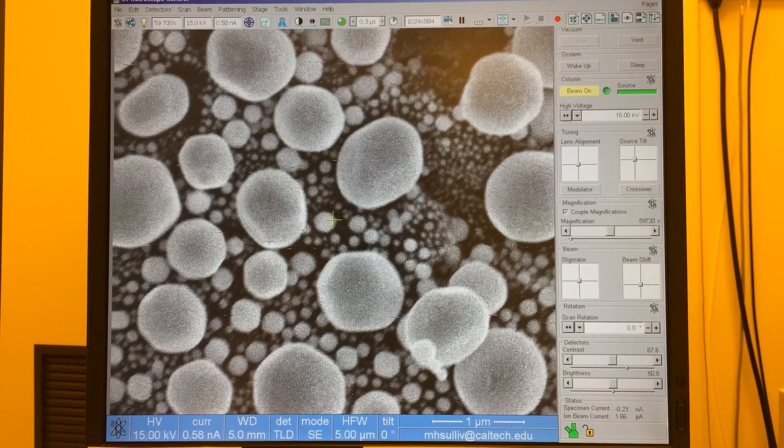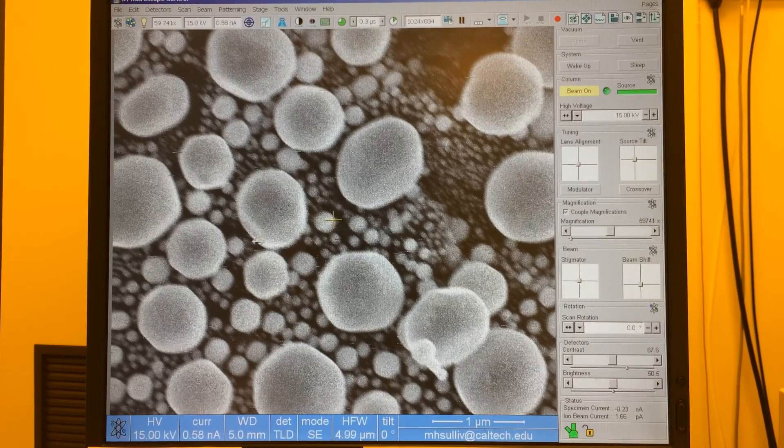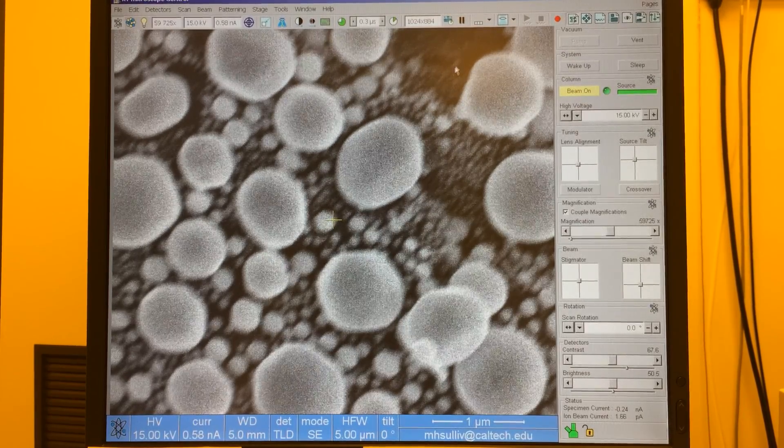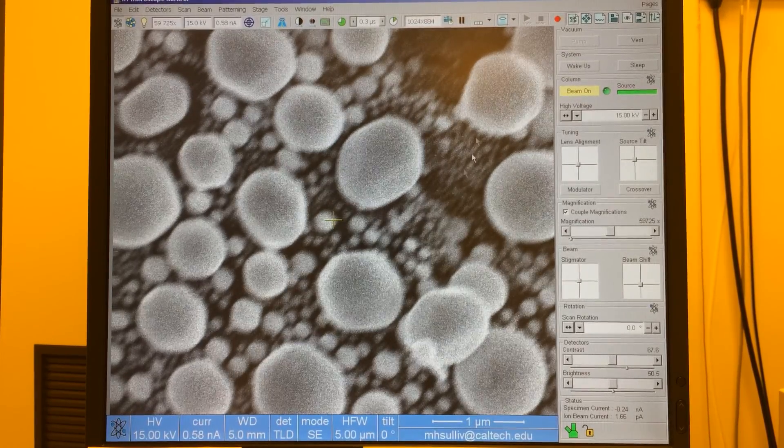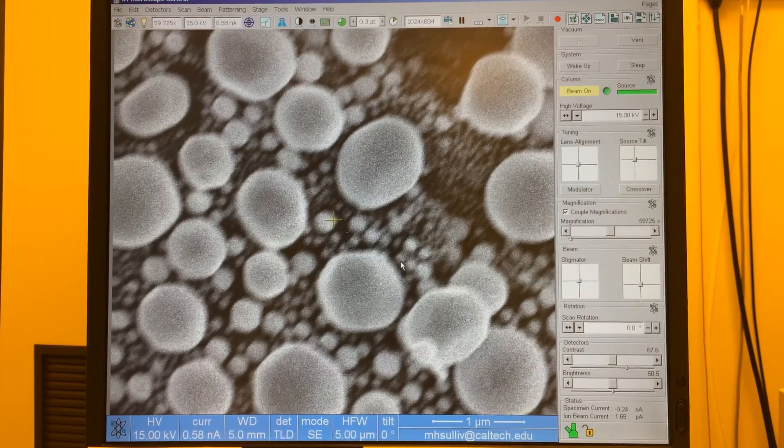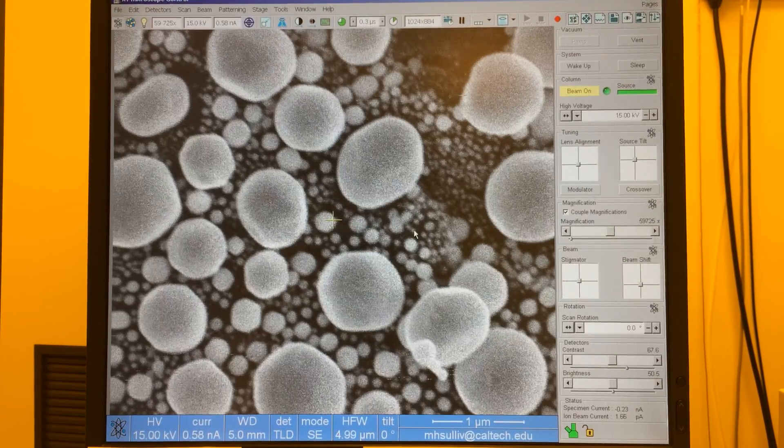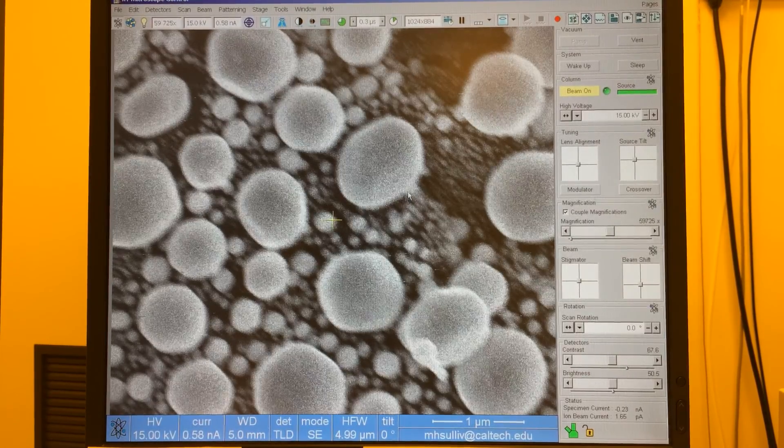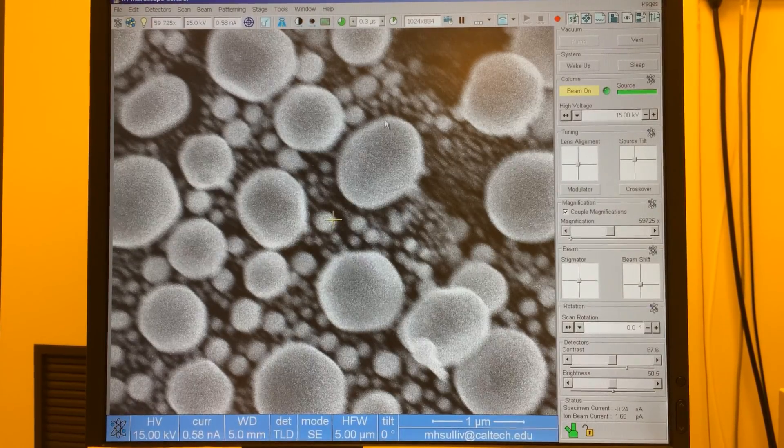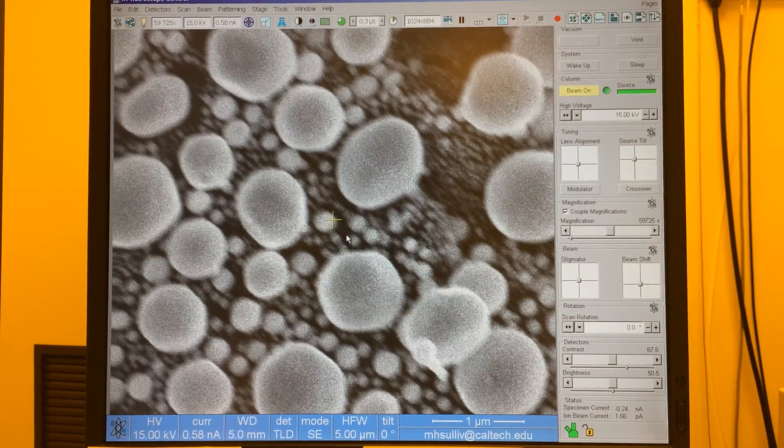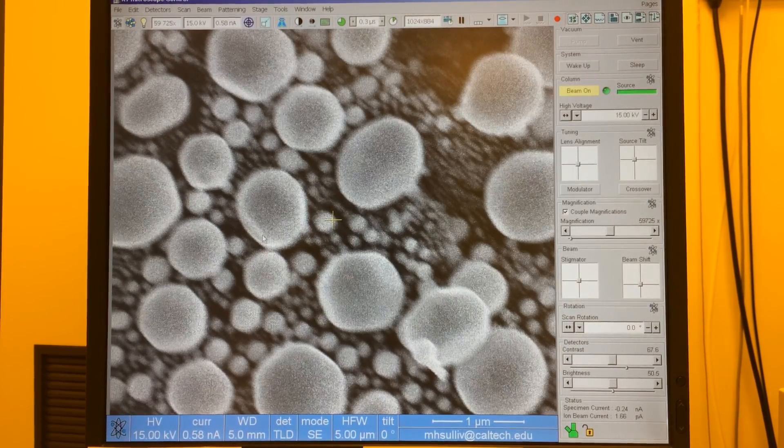In this case there's no shifting so the lens alignment is okay, but as I focus to the right we see a stretch along the diagonal. If I go back to the left we get that diagonal to flip 90 degrees, so that shows us we have astigmatism.